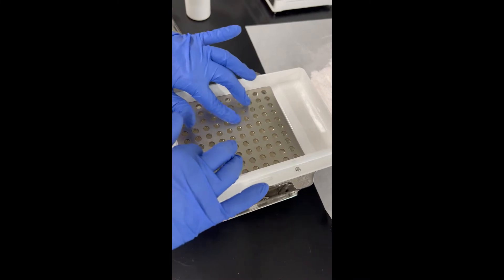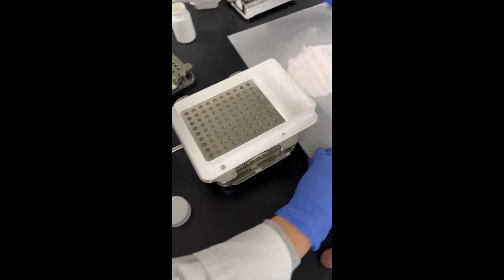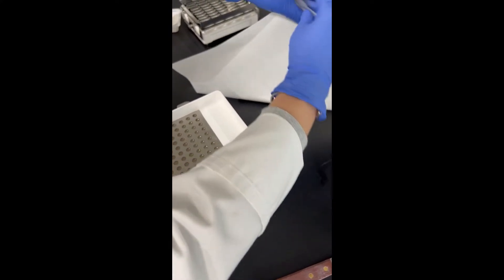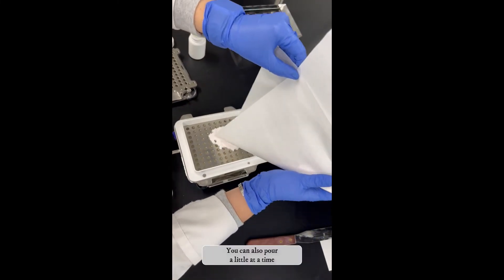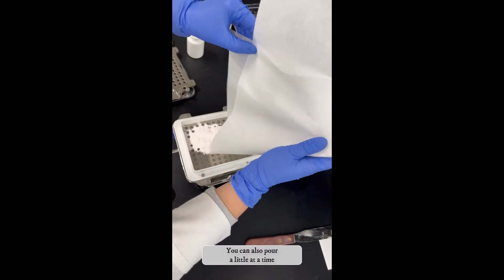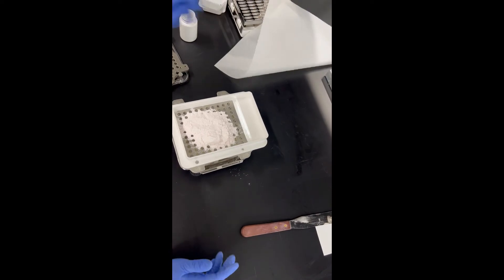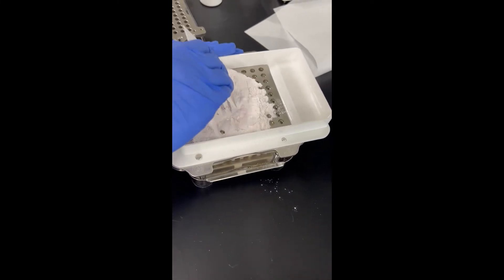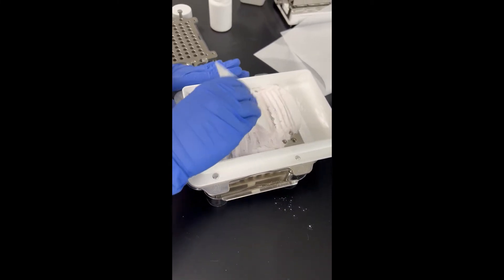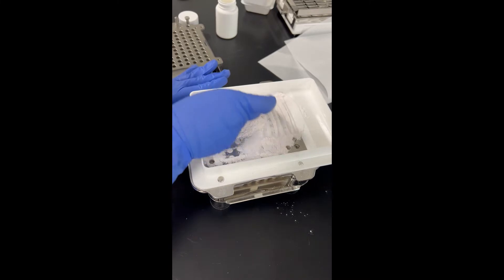Sometimes the capsule bottoms might need a little assistance from your fingers. Now you're going to go ahead and add your powder. The best way to do it is to fold the paper like this and make a little corner on the end, then pour it all on. You'll have a little scraper card and you're just going to start filling — tap and make little lines to try to get it all in there, because sometimes just scraping it across doesn't do the job.